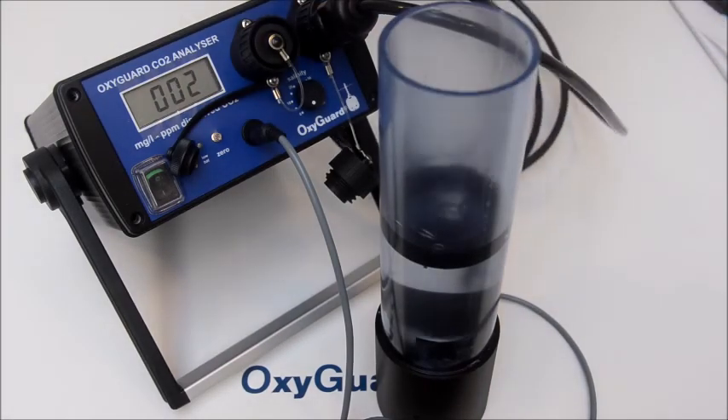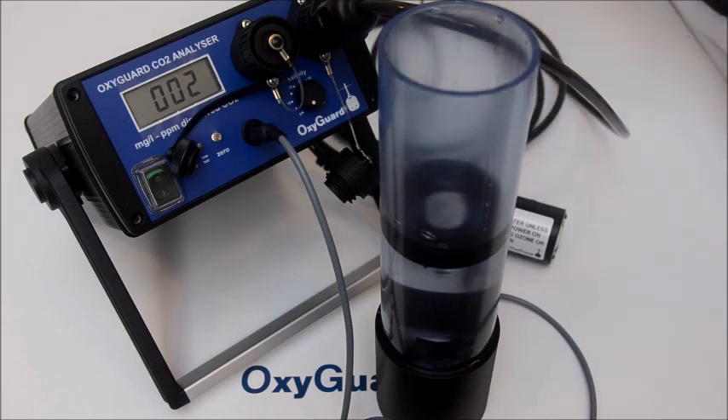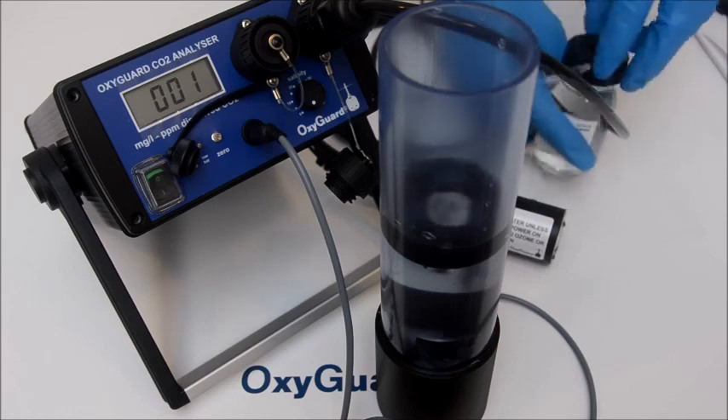Remove the probe from the beaker. Fill the dosing syringe with one milliliter of the calibration fluid and stir for ten seconds.